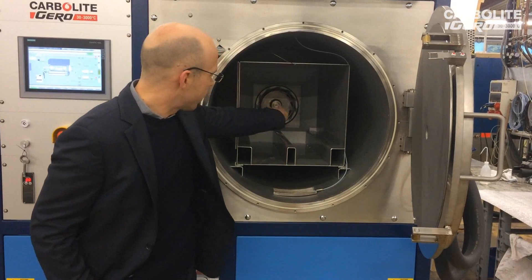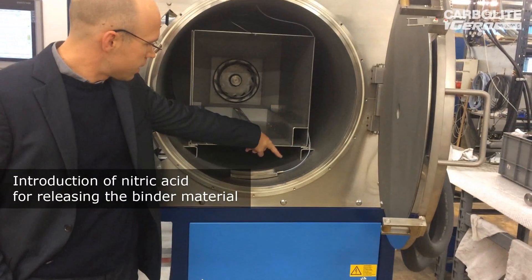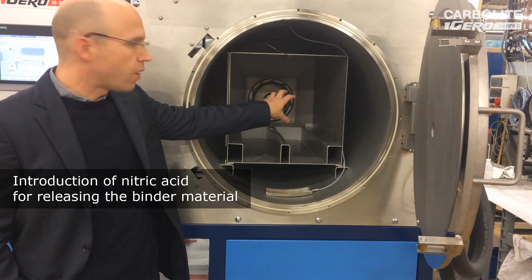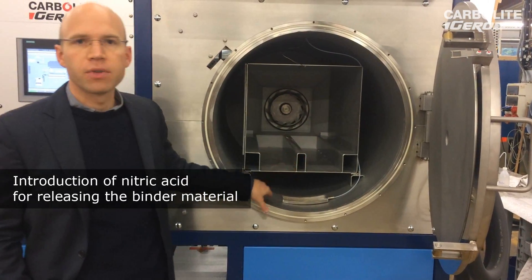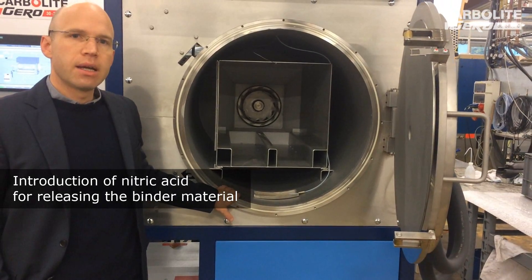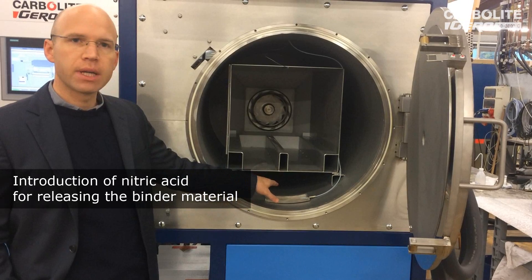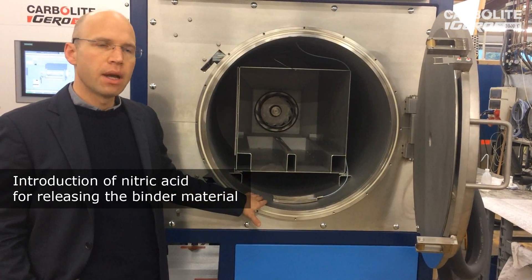We also help attain this good uniformity with the use of this fan. What also happens is that we pump nitric acid into this small cup, and then this nitric acid starts to evaporate, goes into the vapor phase, and is then circulated around the samples with the help of this fan. The sample is produced with the so-called Catamold method, which means we have a binder inside, and with the help of this nitric acid the binder gets chemically reacted.